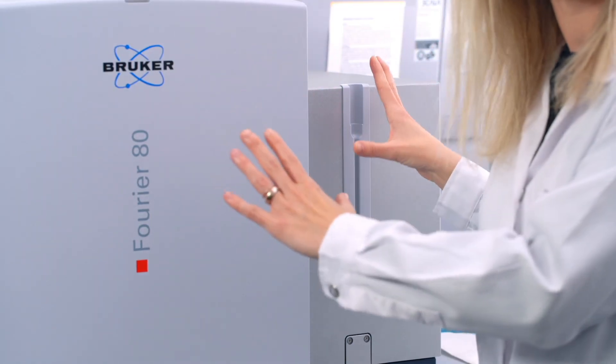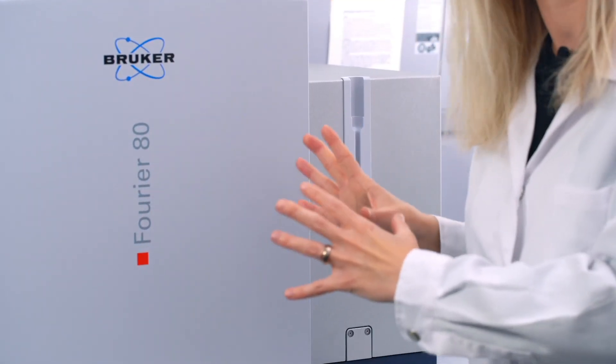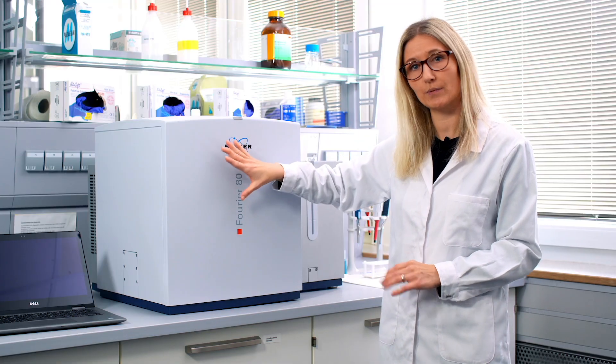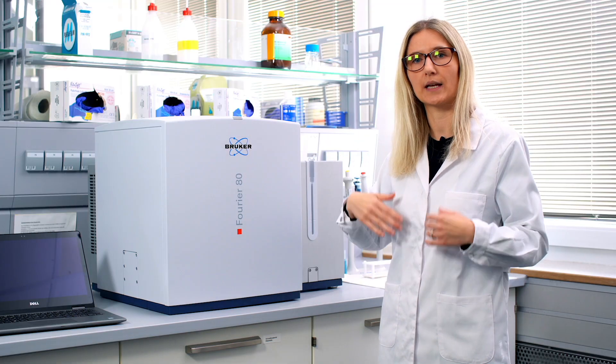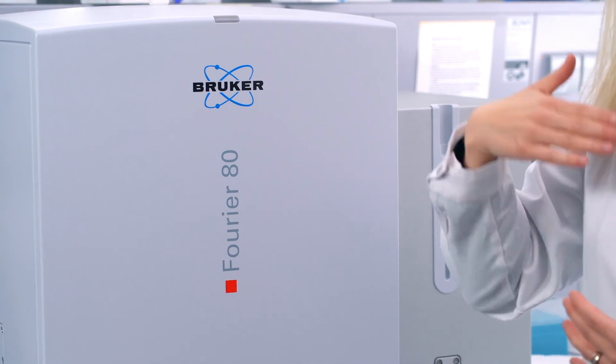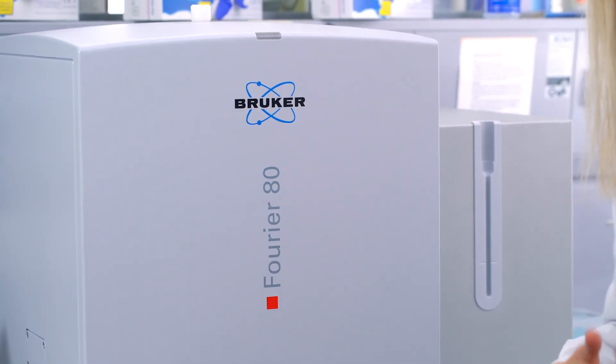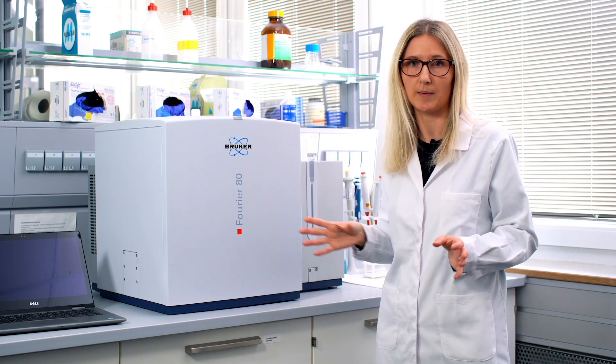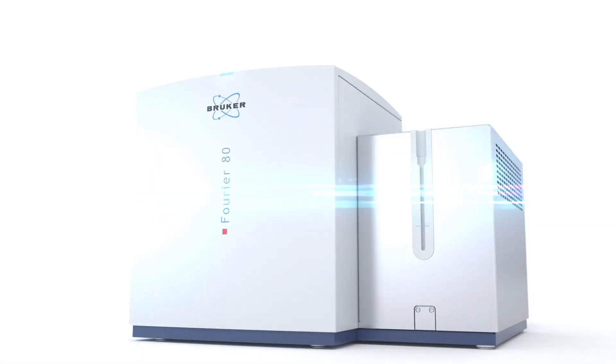So those two housings are separated from each other but still come in one unit and that helps us to keep the magnet at a stable temperature which is really important that you get accurate data and that you can get reproducible data. On the other hand, electronics are easily accessible just in case there's any maintenance needed. So it's a perfect setup for you.